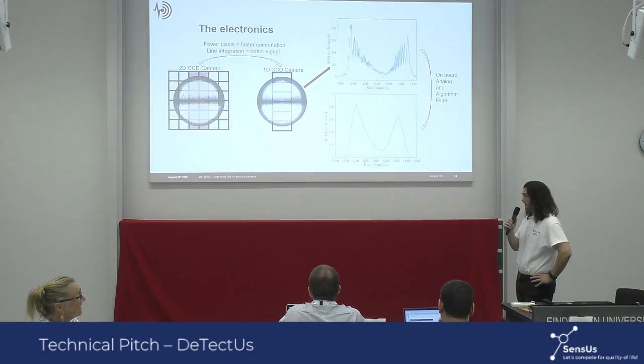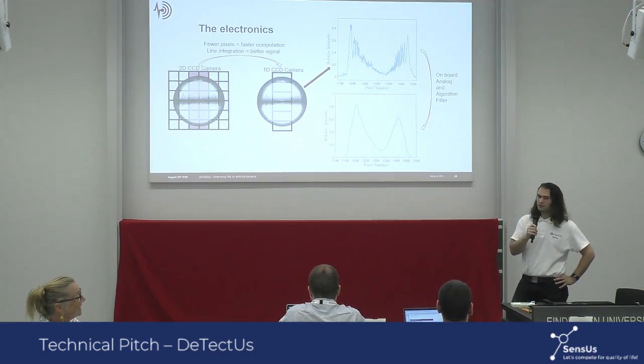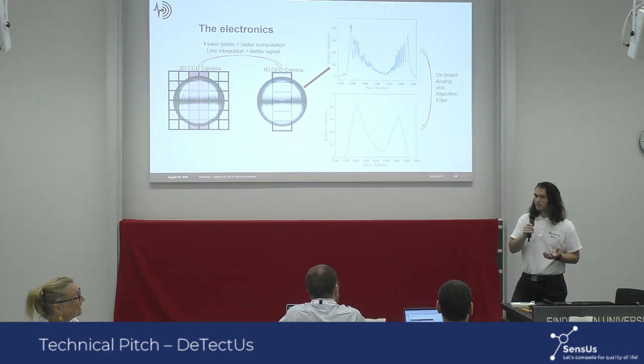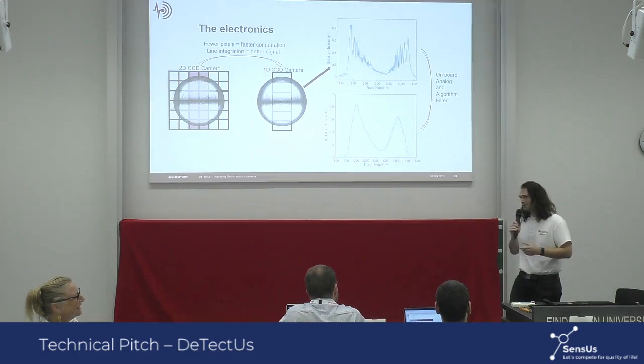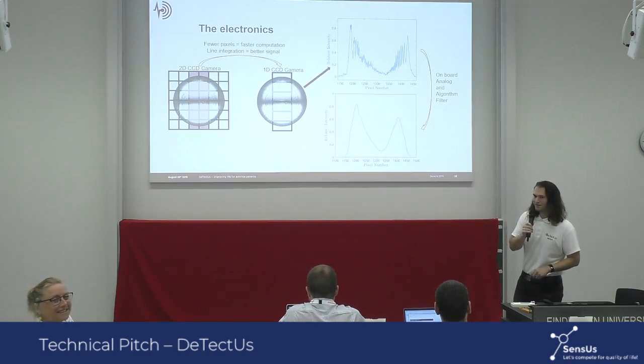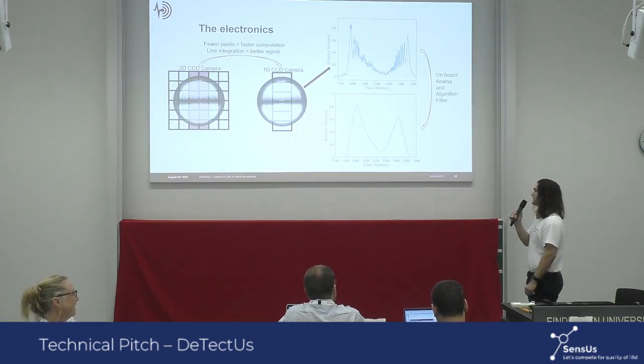So I think it's around 500 to 1,000 euros to build the system, and then we just deposit gold on a glass surface, and that comes out to about, with the reagents, I think around 20-30 kronor per chip, or 5-7 euros per chip. That's right. Can you repeat the second question? The accuracy, yeah, the accuracy of this compared to large scale ones.